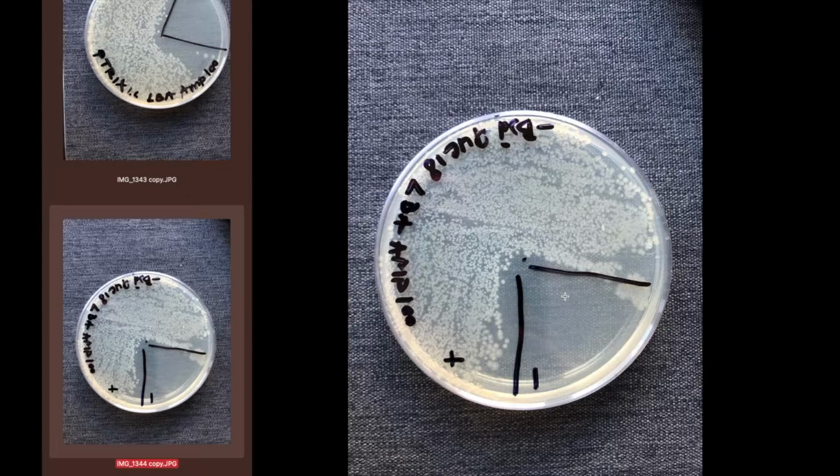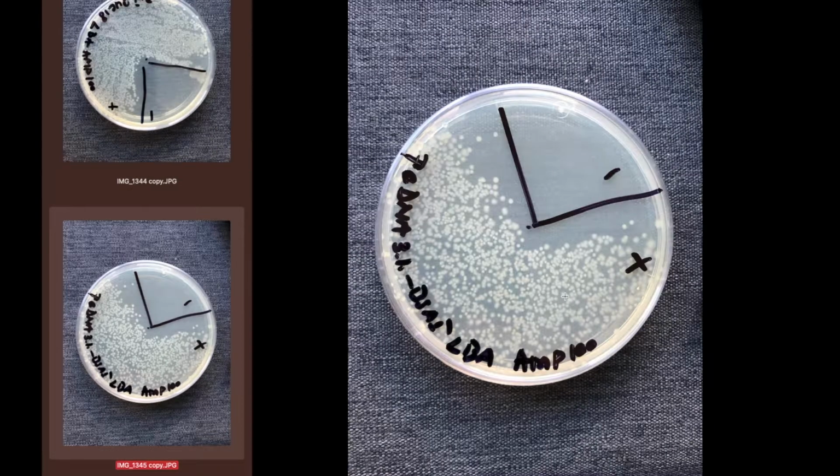This is a modified version of PUC that I engineered and removed the BSA1 restriction site from. And this is also a modified version of pcDNA 3.1, again without the BSA1 restriction site. So if you can see, there is no growth on the negative control, and there's growth on the positive control. That means that the plasmid I inserted into my bacteria provides resistance to ampicillin.